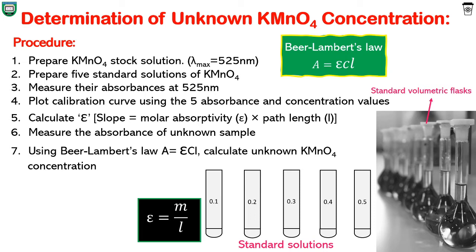Potassium permanganate or KMnO₄ lambda max is 525 nanometers — that is, in the KMnO₄ absorption spectra, there is a peak at 525 nanometers. This is where the compound absorbs at its maximum, which is called lambda max. Now record the absorbance of the standard solutions one by one at 525 nanometers using the UV visible spectrophotometer.